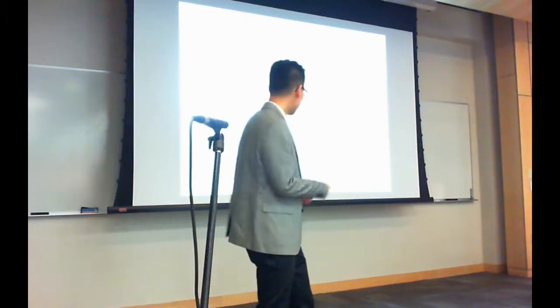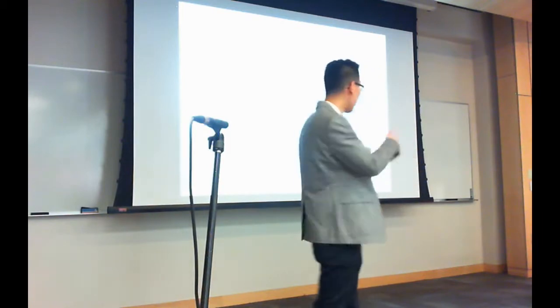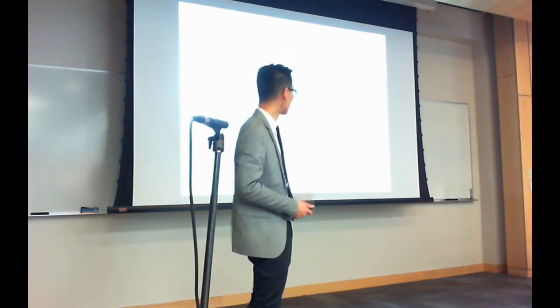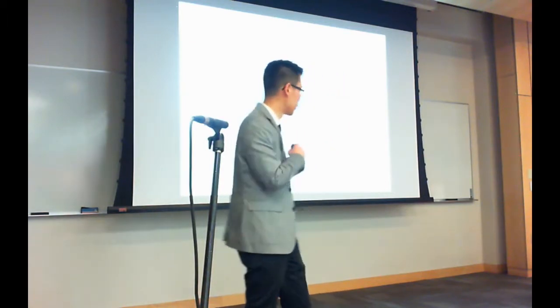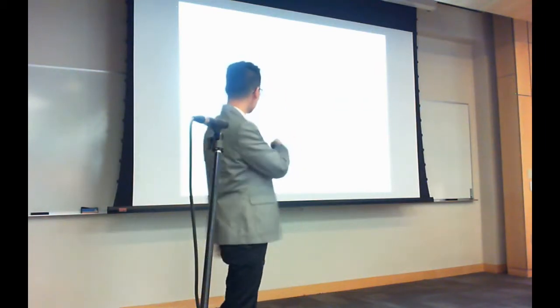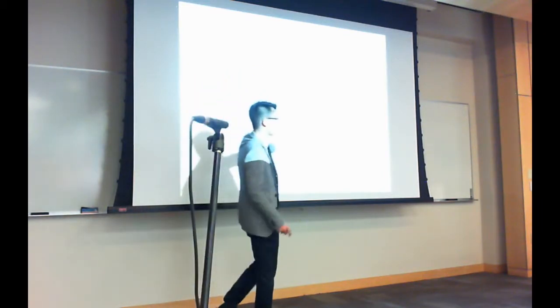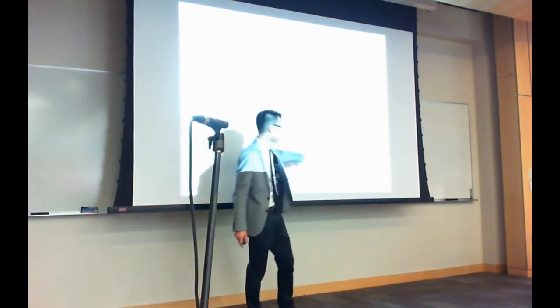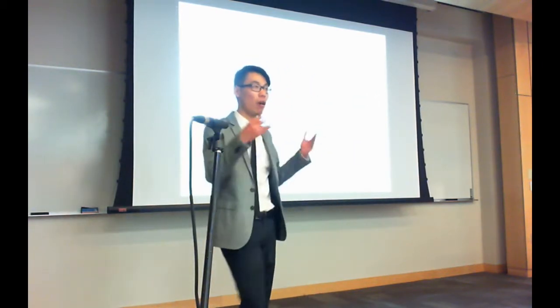And so once we took all this 31 terabytes of data and distilled it down into 2.1 million precursors in a spectral library, this is what we end up with. With NIST, we had about 496,000 precursors, and now we are 4 times larger at 2.1 million. And what's interesting, too, is the number of proteins we start capturing. NIST, at best, was capturing 13,000. But as we move here, without synthetic data, we're capturing 16,800. And with synthetic data, we're capturing 19,600, which is nearly all human proteins out there.